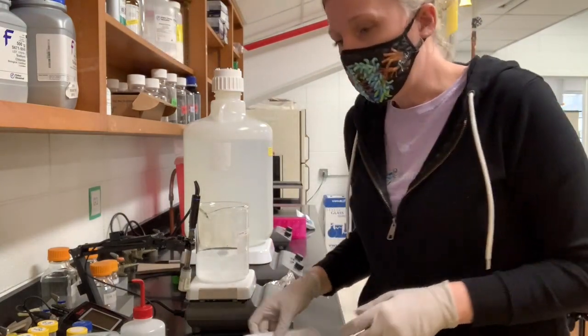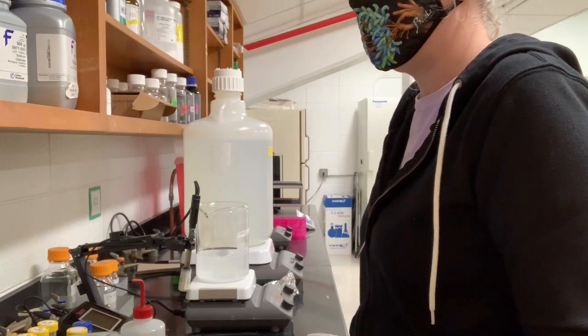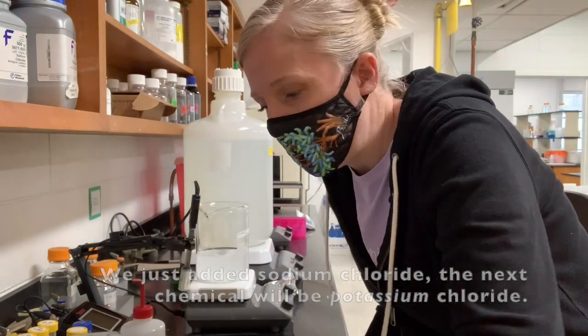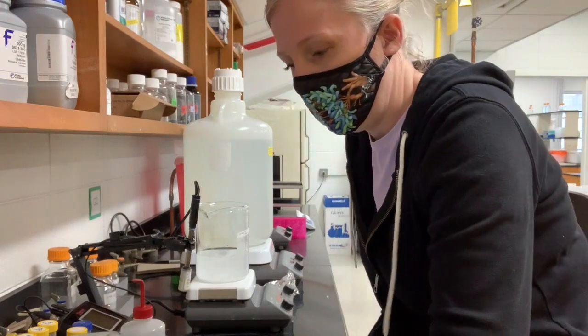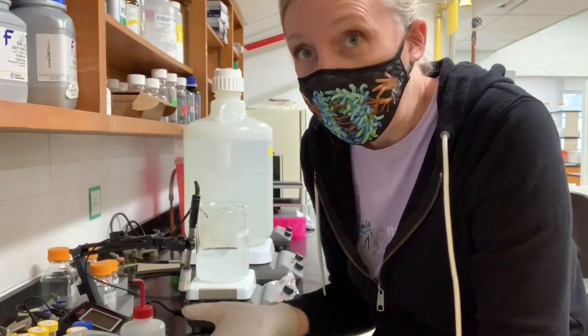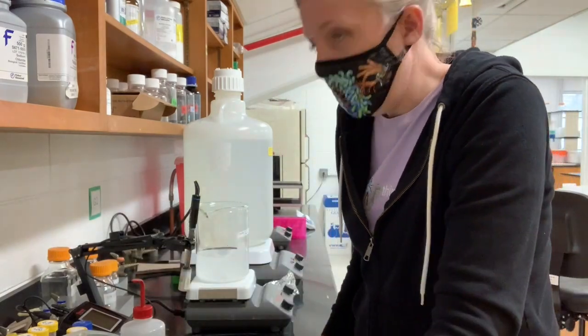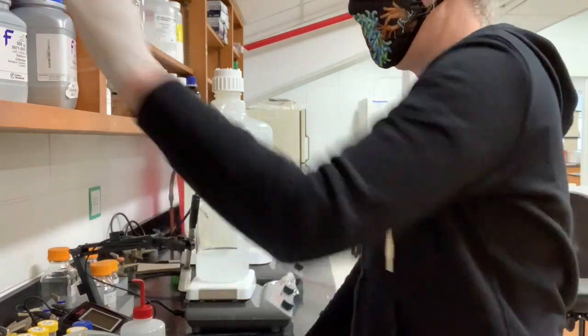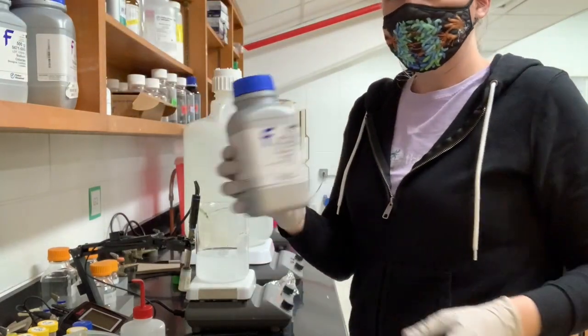The second chemical we have is sodium chloride. I'm just going to use the same weigh boat for everything since everything's going into the same container. That's one reason why I wouldn't want to pour things back into the bottles, because then I could have contamination of one chemical into another. So the next thing I need is potassium chloride.